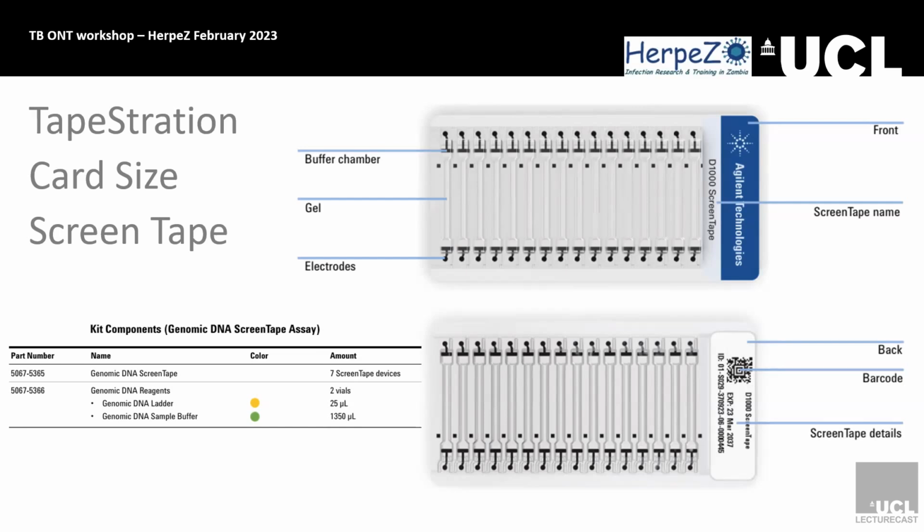Especially if you're using Illumina, it's a must, because with Illumina you don't want primer dimers, which are the smaller bits of DNA that then bind together and get amplified so much more. Even if you've got a small amount, it affects your reads. I think Agilent is generally available in Africa, right? Agilent is generally available here. Because I know that sometimes it's hard to get things.